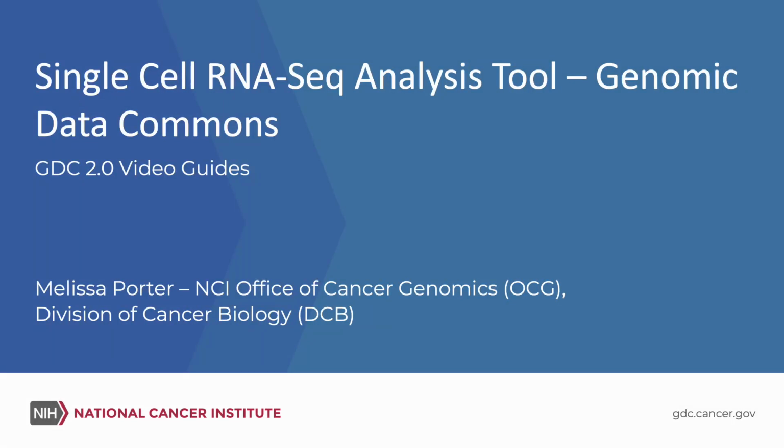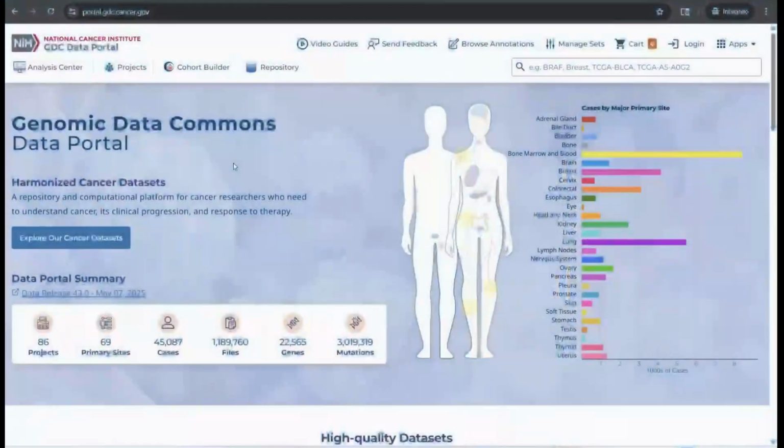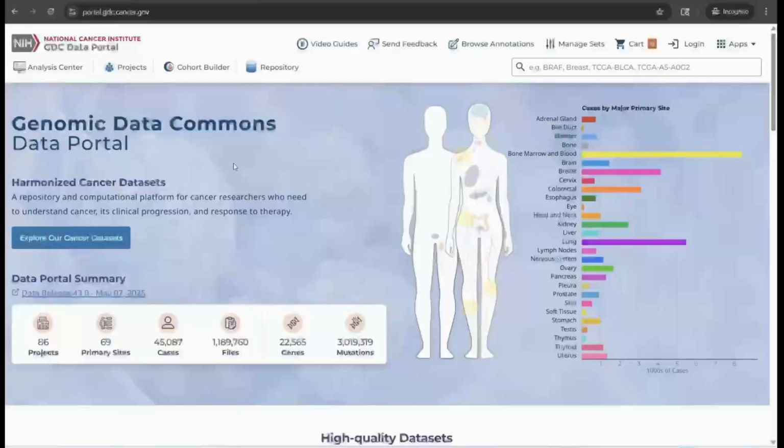Welcome to the Genomic Data Commons tutorial on the single-cell RNA-Seq analysis tool. The GDC's single-cell RNA-Seq tool can be used to analyze single-cell RNA sequencing data with cluster plots and gene expression overlays.